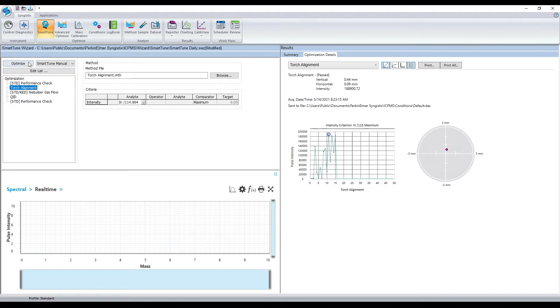Simply click on SmartTune and then click on the optimize button. SmartTune runs a series of intelligent optimizations proceeding dynamically until satisfactory performance results, sensitivity, and background levels are achieved. If you prefer, you can update the optimization routine however you wish.